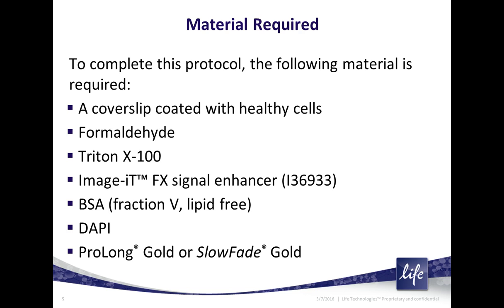Some of the materials that you'll need include, of course, the cover slips with your cells on it, or your tissue section on your slide. Formaldehyde or other fixative that you'll be using, as well as the buffers to put them in, such as phosphate buffered saline or tris buffered saline. A permeabilizing reagent, such as Triton X100 or Tween 20, for instance.